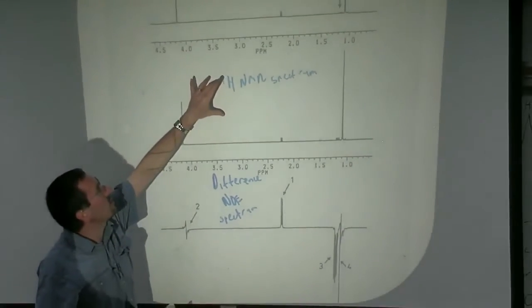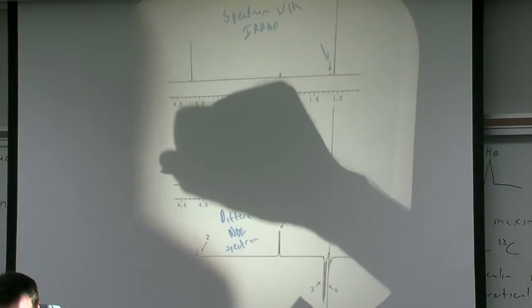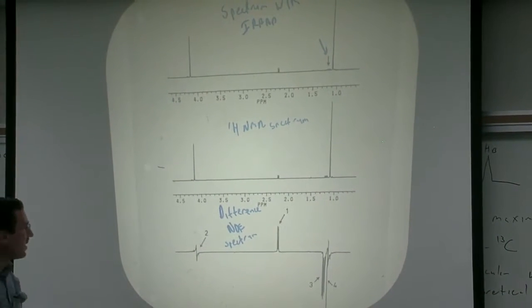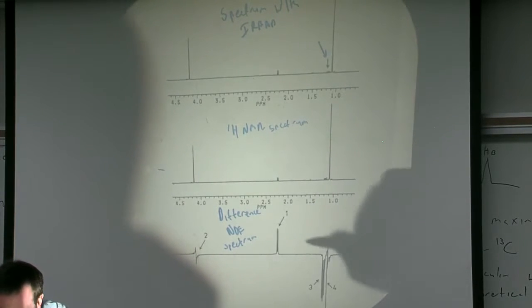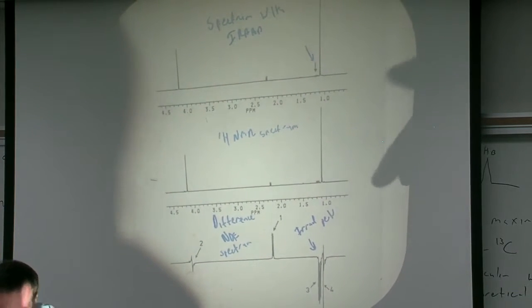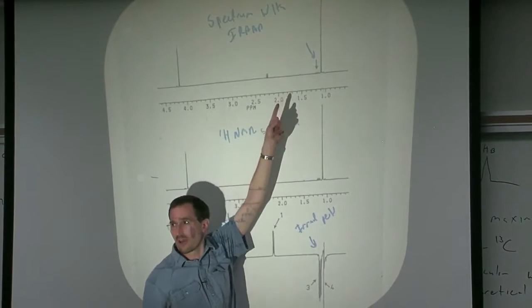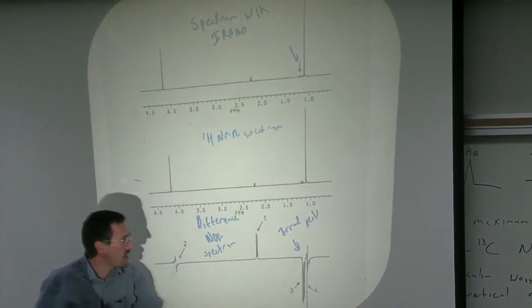You are subtracting the unirradiated spectrum from the irradiated spectrum, so I'll put a minus sign, or actually, I guess you're technically subtracting the FIDs and then going ahead and Fourier transforming. And so I want to point out the features that we see. So the first thing, of course, we see is now the irradiated peak is negative. After all, if we have something where we've almost equalized the population of alpha and beta states, and we take away something where we have a positive peak, you get a negative peak.